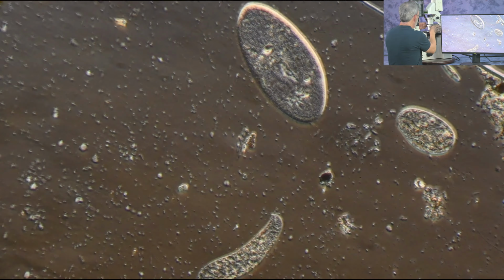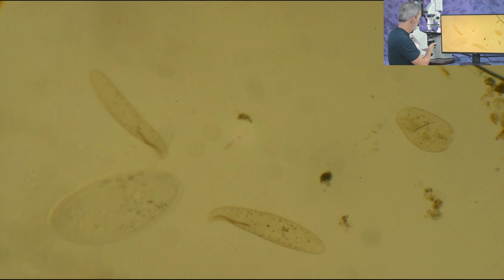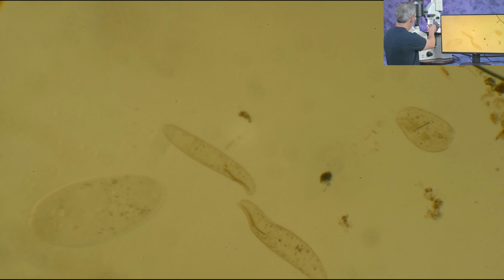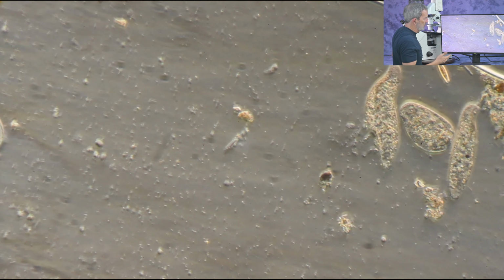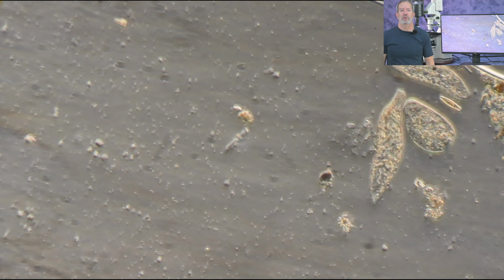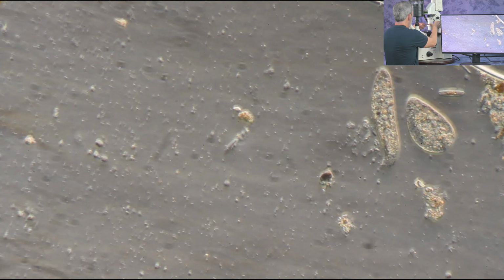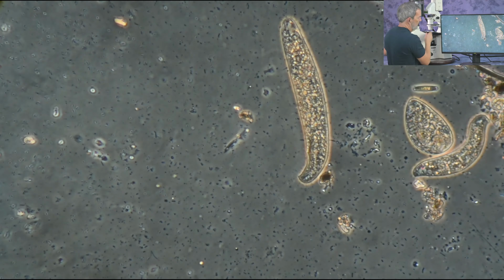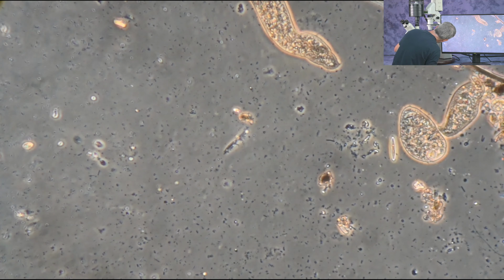And I want to switch over real quick to a bright field. Look how washed out it is. I haven't changed my focusing. I've just switched it. So there you can see tremendous difference in contrasting when you switch from bright field over to the Varel contrast. And just to keep going through the same thing over and over, the phase. Okay, so that's the LD A plan.